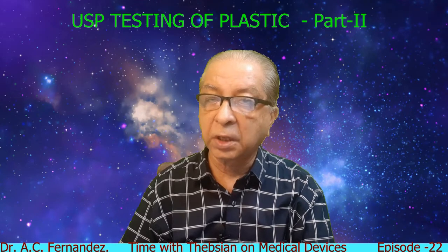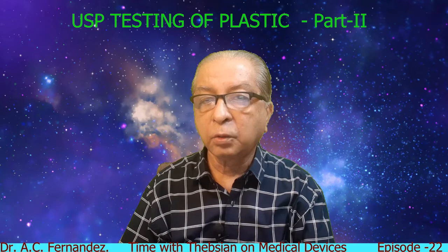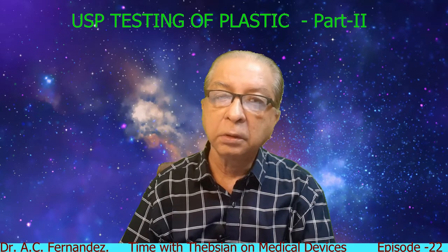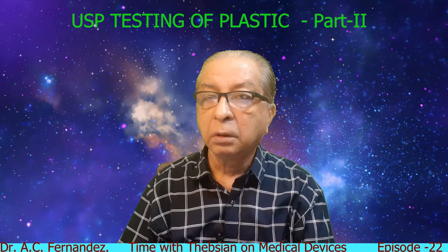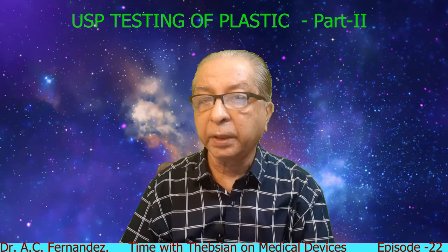So we have seen that the extraction mediums are sodium chloride injection, 1 in 20 solution of ethyl alcohol in sodium chloride, polyethylene glycol 400, cottonseed oil or sesame oil IP grade. So 4 extraction mediums are there.